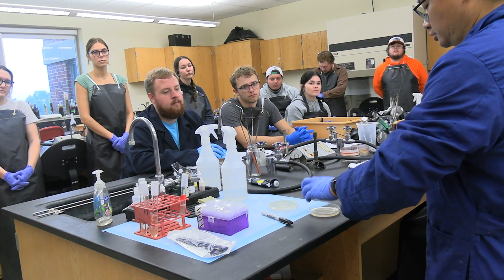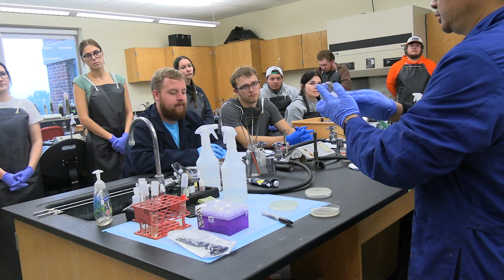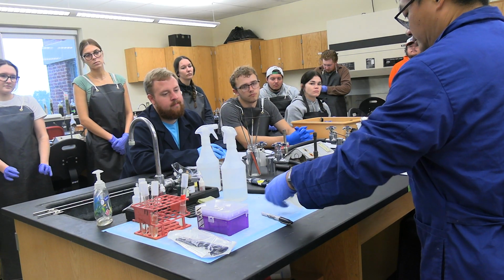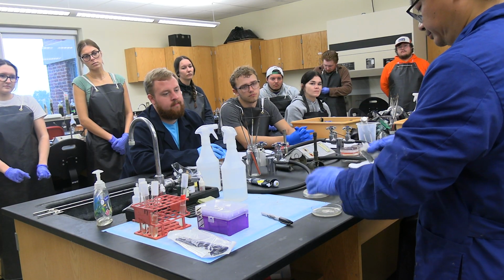Okay, so inside, you also got to do a very gentle clean. Not the agar, I mean the lid. Okay, so inside also clean very well.